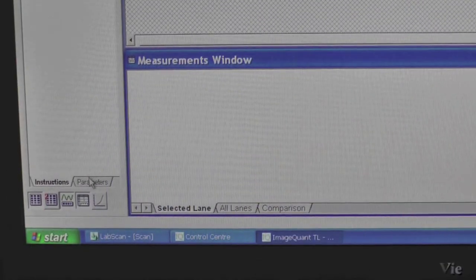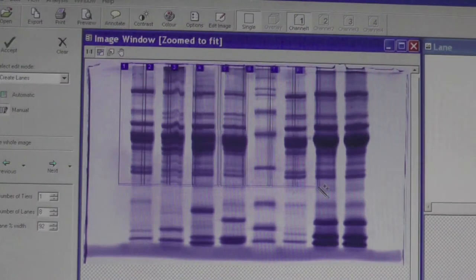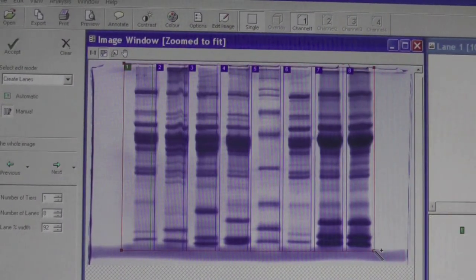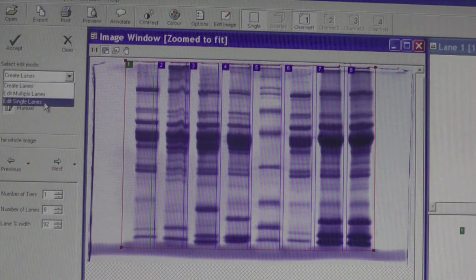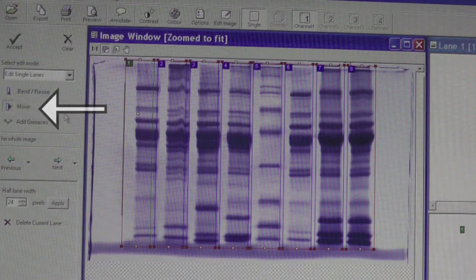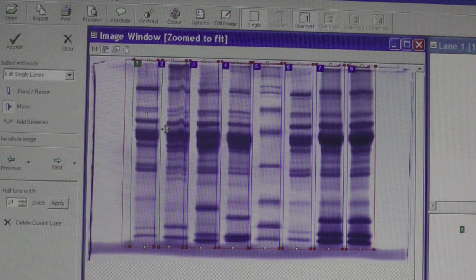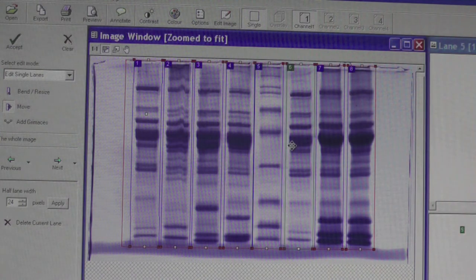Go to the Parameters tab located on the bottom of the left panel and identify the number of lanes present on your gel you wish to select. Proceed to click and drag a box across the image of your gel, ensuring that each lane is fitted with a rectangular outline. You can click the Clear button and reselect if you're unhappy with the lane selection. To edit individual lanes, select Edit Single Lanes from the drop-down menu. Select the Move button to move the rectangular outline side to side in order to better fit the gel image. Make sure not to move the outline up or down in order to avoid accidentally cutting off bands.